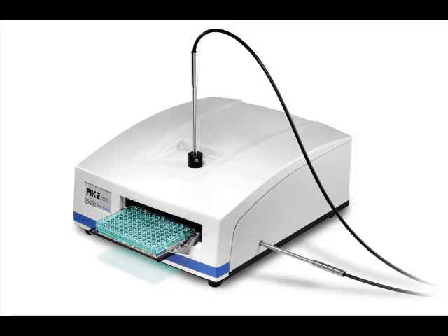The Pike Technologies Out-of-Compartment Microplate Reader is a unique accessory available for selected UV-Vis spectrophotometers. It offers high throughput plate reading capability to a wide range of traditional instruments with standard sample compartments.